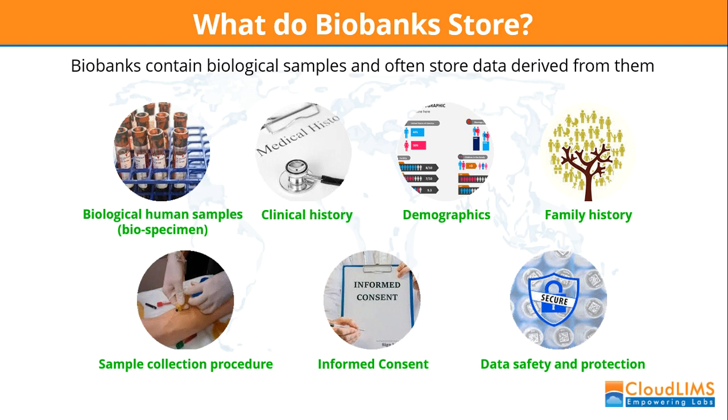But in particular, the biobanks that relate to human study can store several types of samples, and these can range from blood, serum, plasma, urine, to parts of entire tissue, tumour samples, etc. And as we've mentioned, we store that alongside the data derived from these samples.